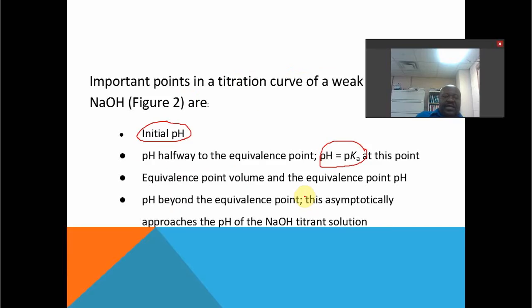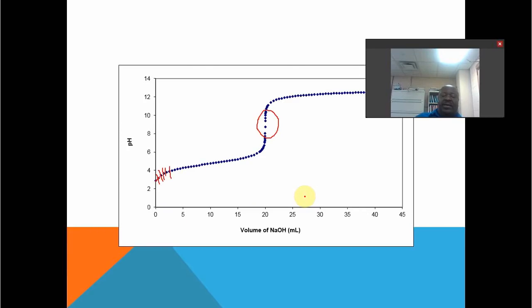All right, then go back to the previous slide here. After the equivalence point, we're still adding hydroxide in this particular titration curve. So the pH over here is simply controlled by the excess hydroxide. Titration curves.